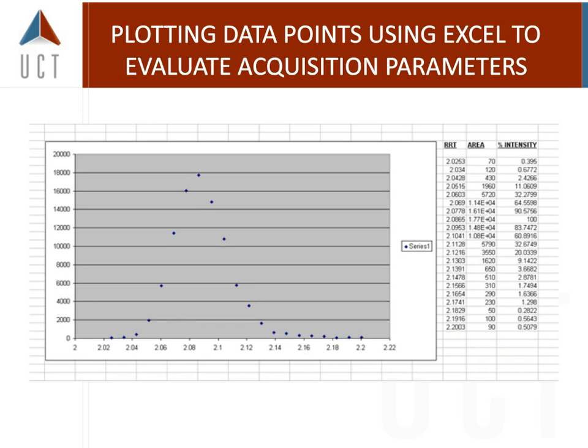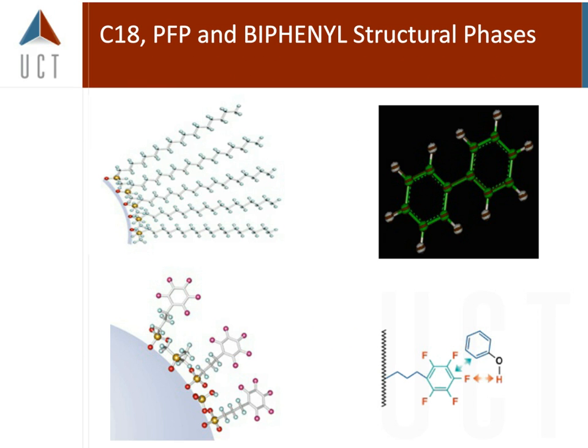Very simple. And what this gives you now is a picture of your actual peak, and you can count how many points you've created. It's a very quick way of doing some method mass spec development to try to get those best peaks. And in this particular case, there's 12 points on this peak. I wouldn't go ahead and be making many adjustments because I've got plenty. The peak shapes look good. But now I know my instrument is giving me appropriate data. I can go backwards, reverse engineer, and evaluate the rest of the process, including the sample prep.